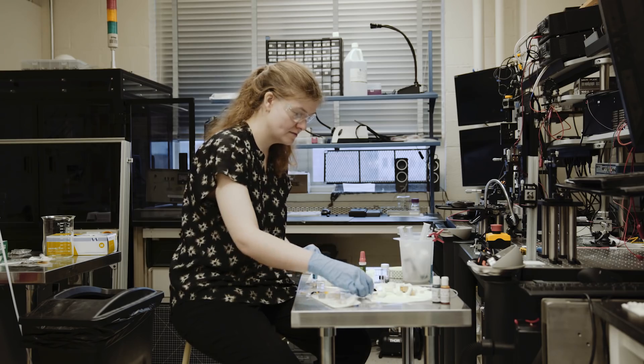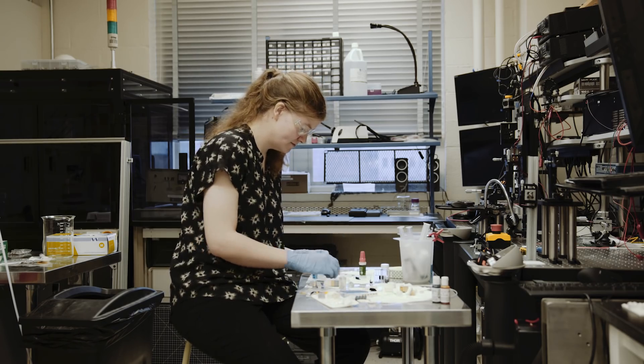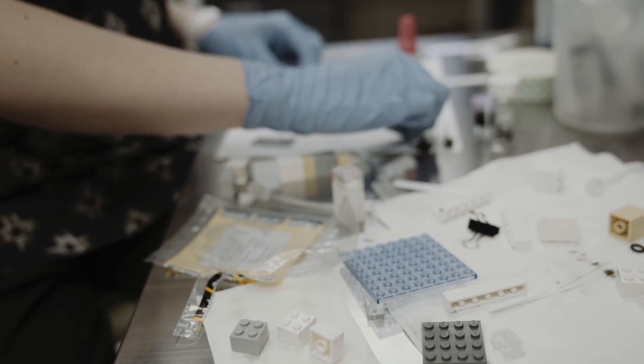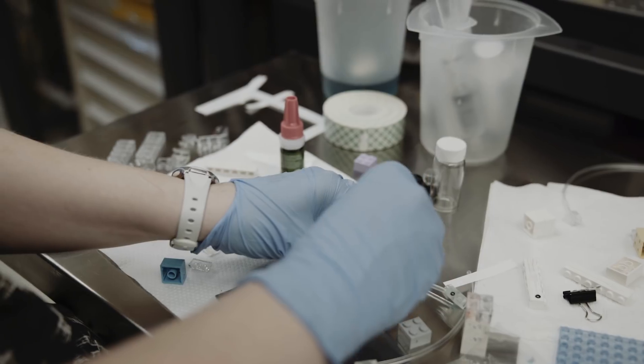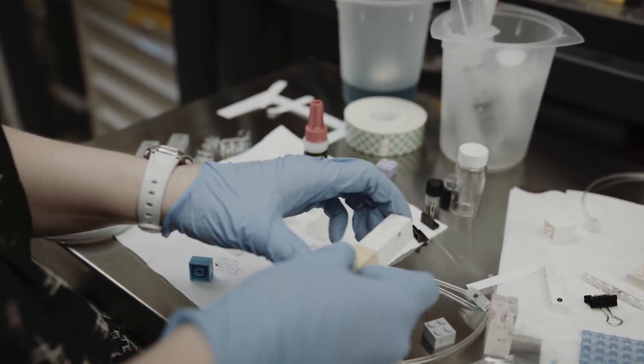Looking for ways to make microfluidics modular by assigning a single operation to a single module or unit, the MIT team turned to LEGO bricks as the basis of their new design because of their precision and consistency. No matter where in the world LEGOs are found, they are guaranteed to line up and snap seamlessly and securely into place.